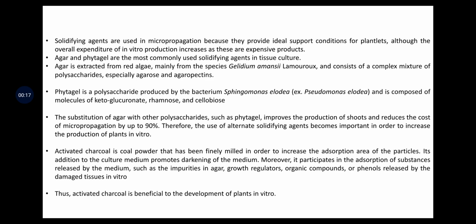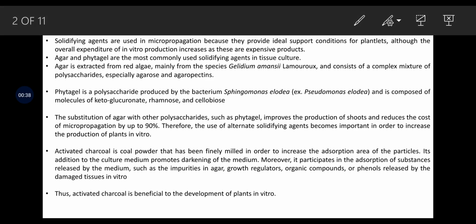Solidifying agents are used in micropropagation because they provide ideal supportive conditions for plantlet growth, although the overall expenditure of the in vitro production increases as these are expensive products. Agar and phytogel are the most commonly used solidifying agents in tissue culture. You need to remember the most commonly used solidifying agents are agar and phytogel.